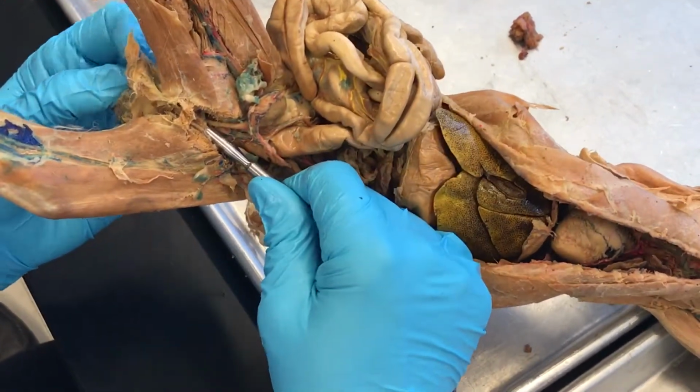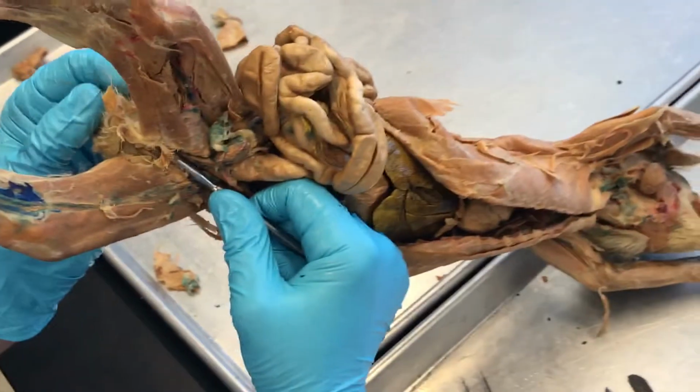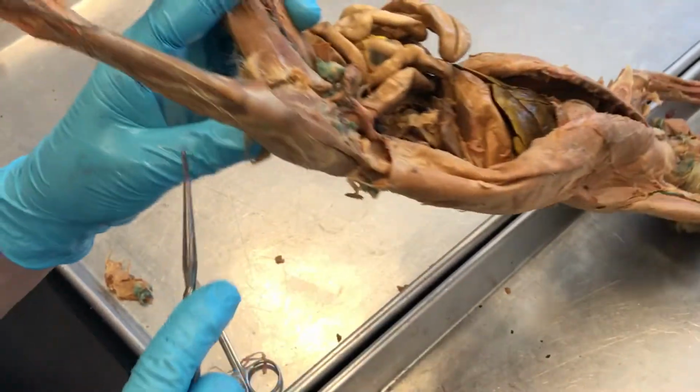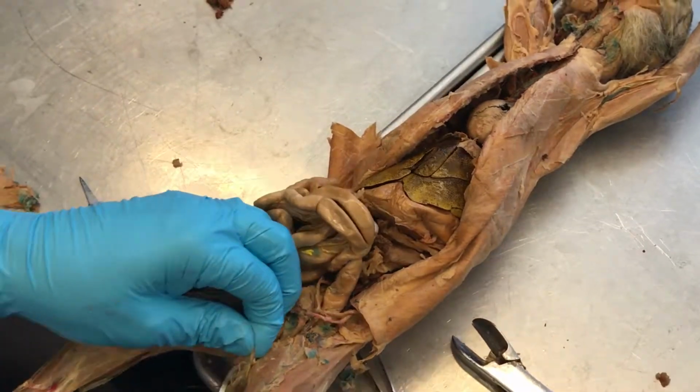I feel like I'm poking a new opening. That's all right. You did it to the male, no problem. We've got an opening in front of the anus, but I'm not making a connection between the two of them.